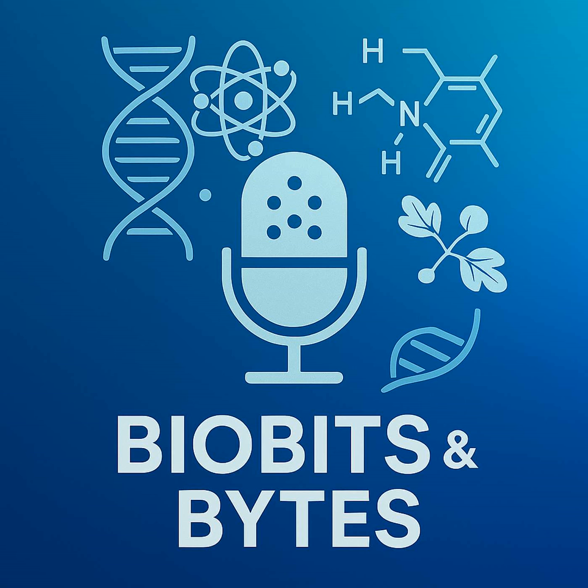Okay, we've done the tour, Southern, Northern, Western. Let's switch tracks a bit to ELISA. How does that fit in? How does it compare? And what's it mainly used for? Right, ELISA. Enzyme-linked immunosorbent assay. It's another type of immunoassay, meaning it uses antibodies. But the format is quite different from blotting.